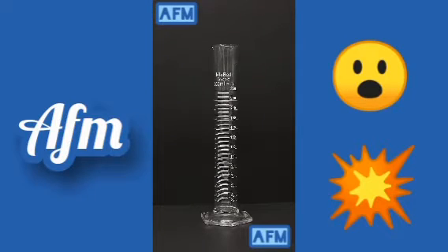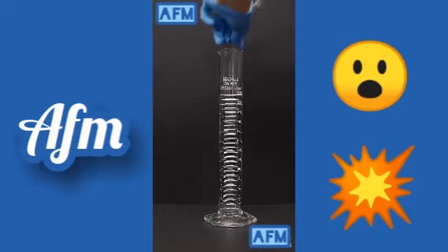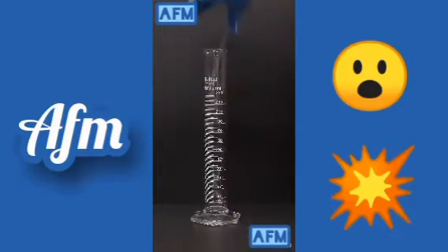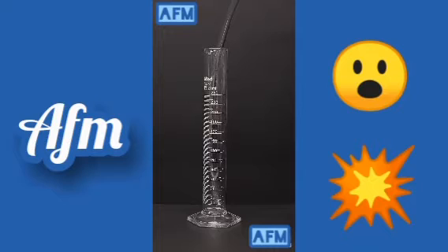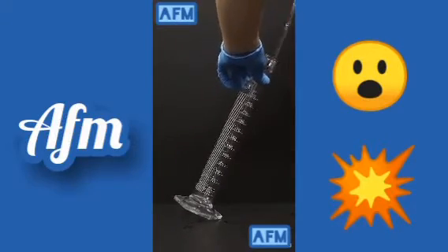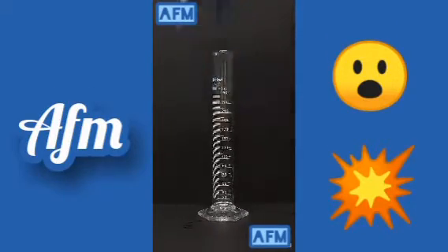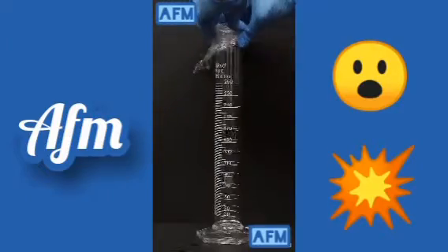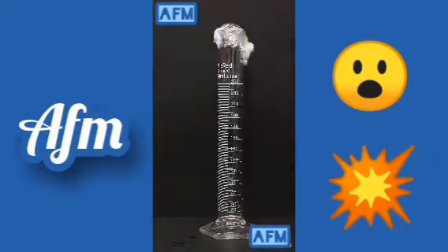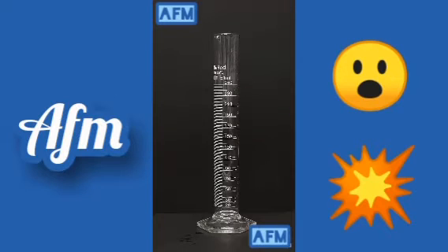Today, I'm going to be showing you the classic barking dog experiment that I did a while ago on my YouTube channel. To do this, I just have to fill a tall cylinder with nitrous oxide gas, which is the same thing that they use at the dentist. Then after that, I can add a few drops of a solvent called carbon disulfide. Now I just need to cover the top and shake it around a bit. I should now have a mixture of the nitrous and the carbon disulfide, and all I have to do is light it on fire.